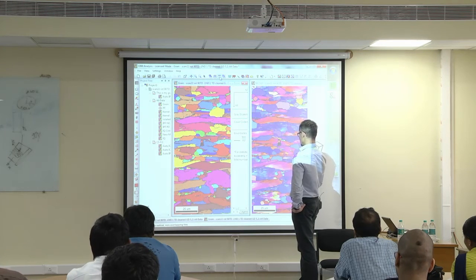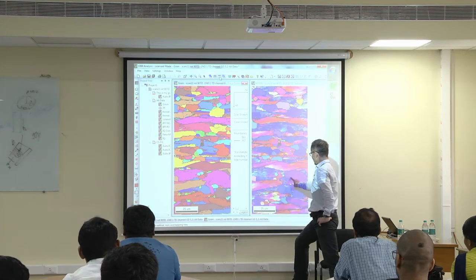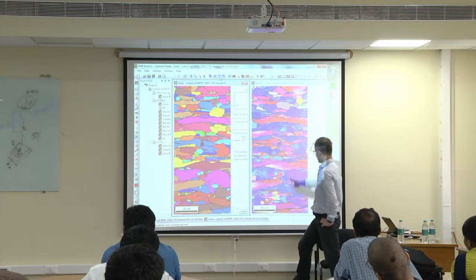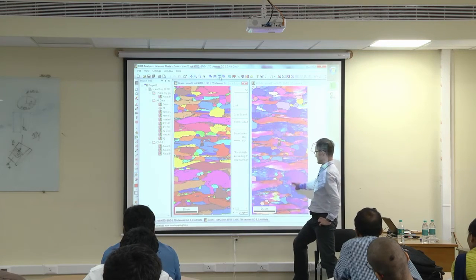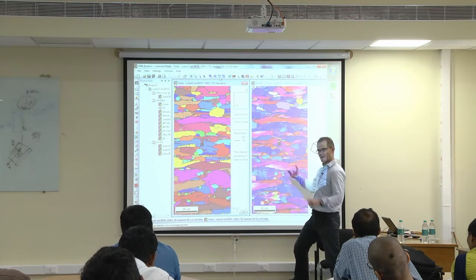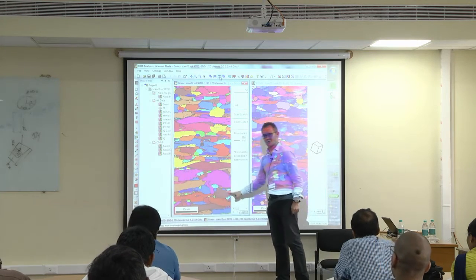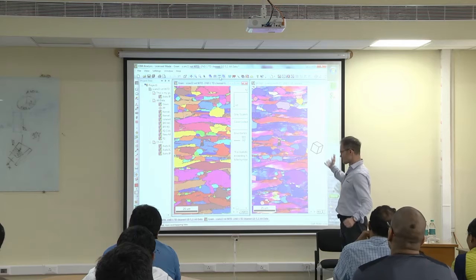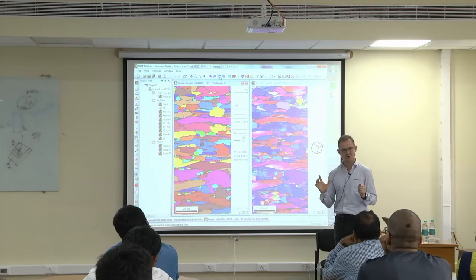Let me look whether I see. Yeah, for example, interesting here. This grain here, this one, and this one here. It seems to be actually not one grain. So this one is clearly a new grain, and this one is a deformed structure. I would guess this grain has grown out of this deformed structure. That's why they don't have a large angle misorientation here, and they grow into each other. But the software has considered this to be one grain. Also not ideal. So in this case we can maybe tolerate that, but you may have situations where you don't want to tolerate that.